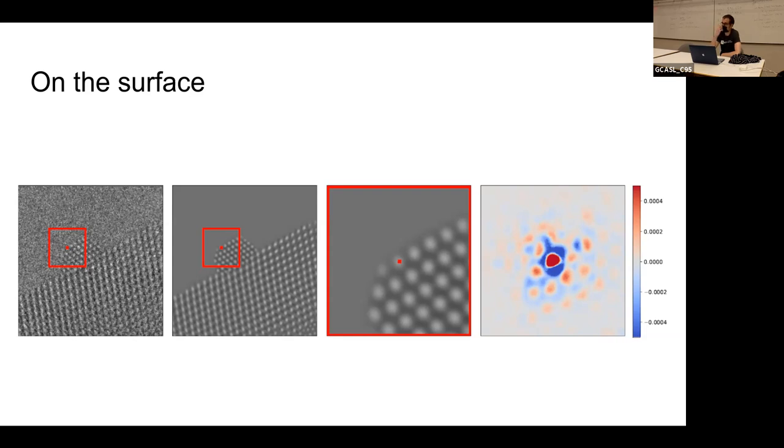This brings us back to your point previously about adaptive filtering: knowing the structure of my data is roughly like this, so why don't I adapt the averaging that I'm doing? Before neural networks, we used to do these things by hand. By hand, I mean you detected edges or whatever, and you said, I'm only going to average within those edges, or I'm going to do adaptive averages based on what I think is under there. The neural network, which we train in a completely data-driven way, apparently does this automatically. And we can see this because of this linearization, by just computing the gradient and visualizing. Something important to realize is, sorry, go on.